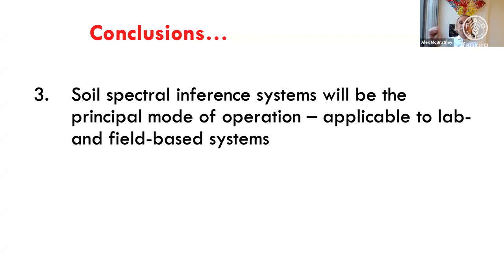I believe that soil spectral inference systems will be the principal mode of operation. So putting together the calibration equations, the spectral transfer functions with the pedo transfer functions will be the way we do this. And this will be applicable to both laboratory and field-based systems. So you'll put in the soil, you'll collect one or two different kinds of spectra, and it will really tell you about 200 soil properties with their uncertainty. And if they're very uncertain, then you might go and say, well, we've got to go and measure that. But that's how we feed the soil information systems of the future. Next slide, please.